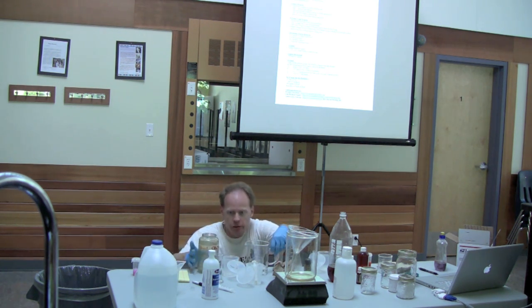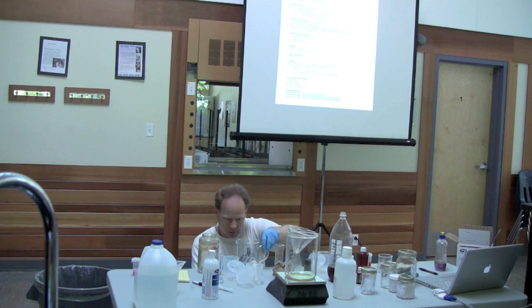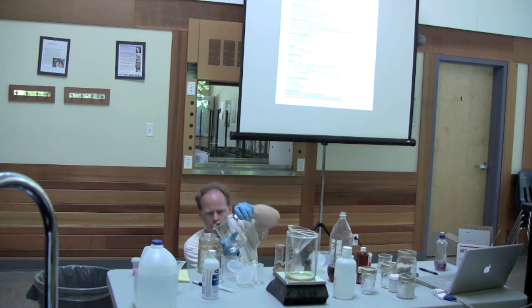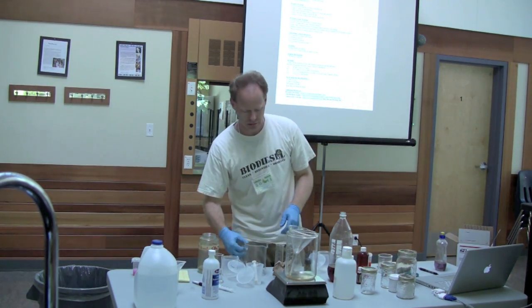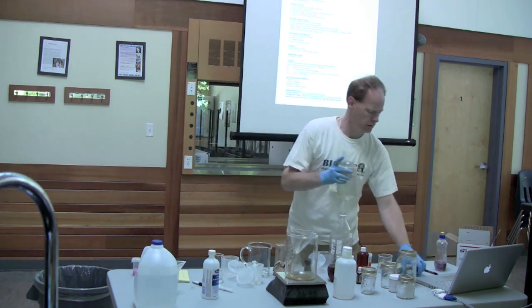Okay, I'll knock it down. Because I'm doing 500 milliliters, 0.2 of that is 100 milliliters. So 100 milliliters of methanol.